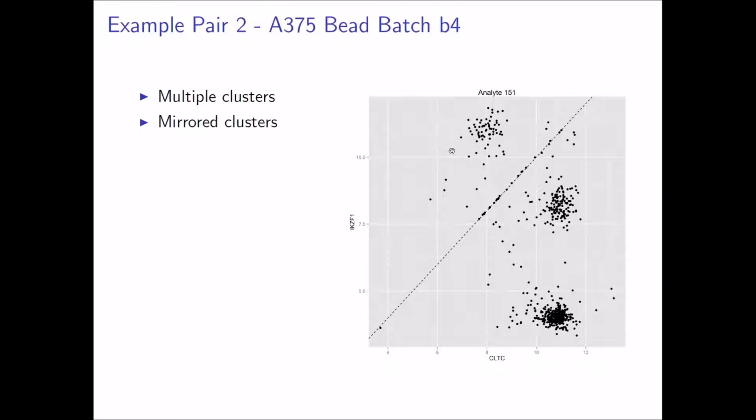I'm not sure if that's this gene flipping issue or something else. You also get a fair number right along this 45-degree line, which is x equals y. That's when the two genes are unable to be deconvolved for whatever reason.